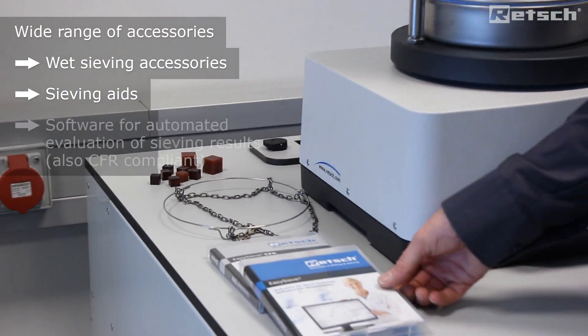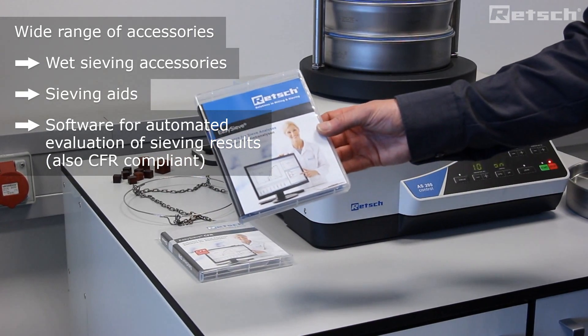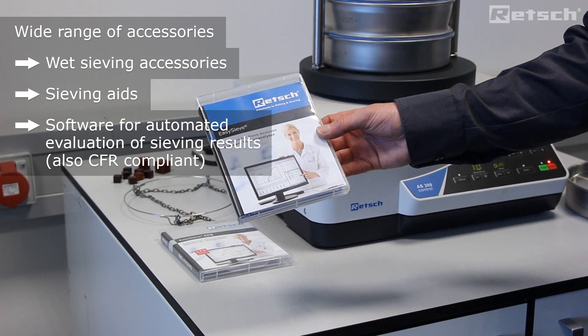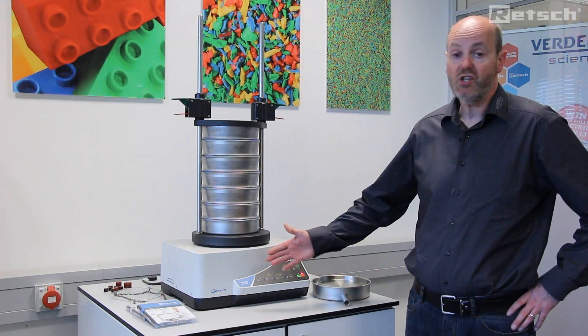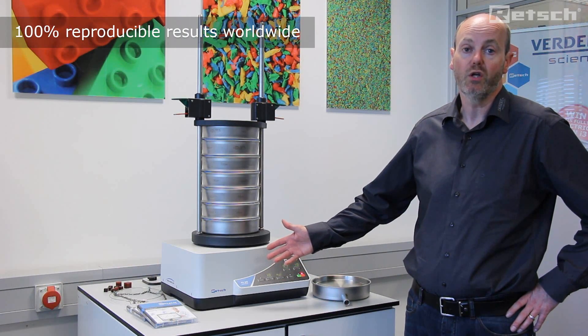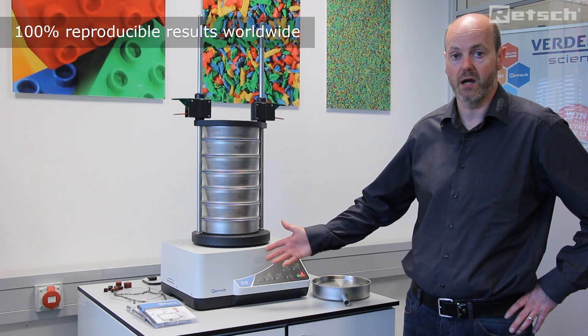Furthermore, we can also supply as an option EasySieve sieving software. This is for the automated evaluation of sieving results for the AS200 control model only, via a USB cable. The AS200 control model is trusted worldwide to ensure truly reproducible particle size determination results are guaranteed every time.